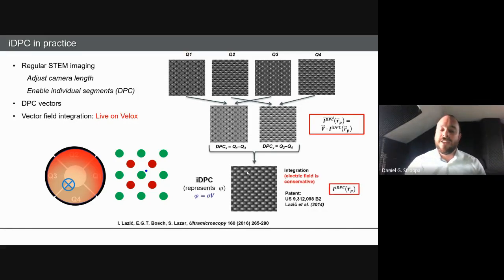How does it look? You get information on the heavy and the light elements all together. If you think of traditional STEM, it gives you an image like this, which is quite nice, with quite high resolution. It's the same material I put here for comparison, but I had to magnify a bit to match it.